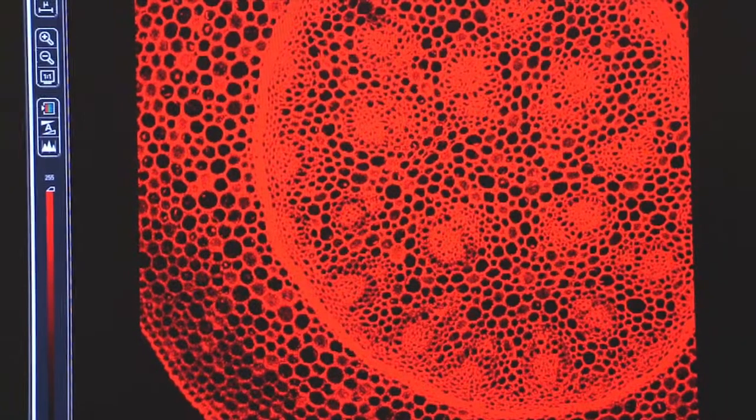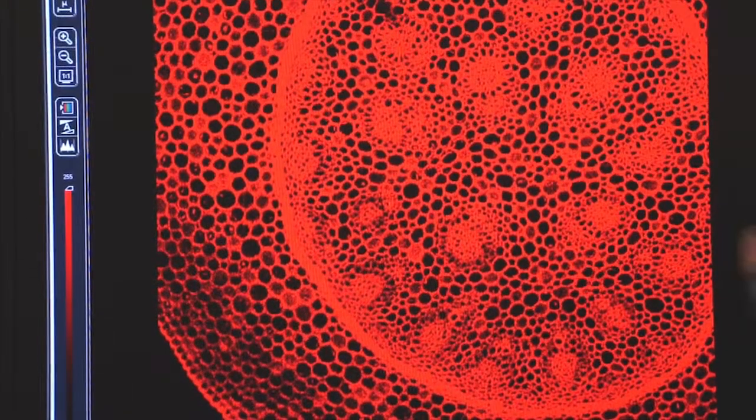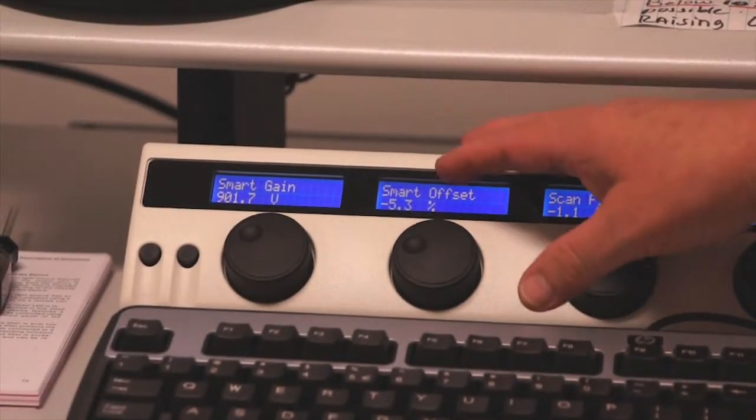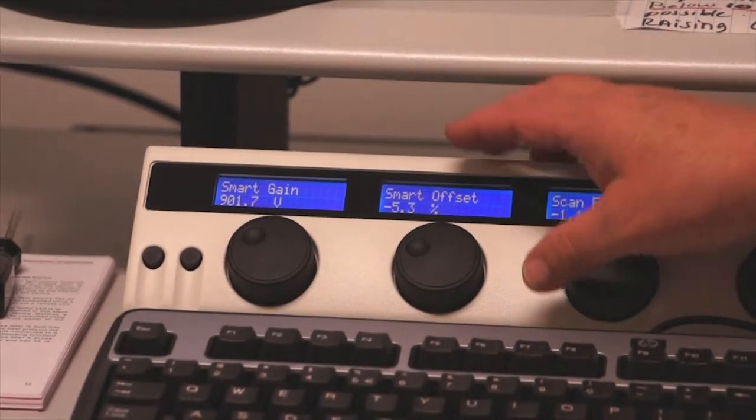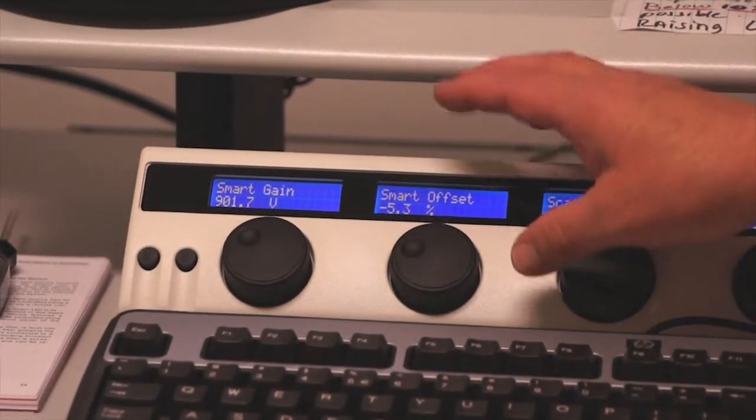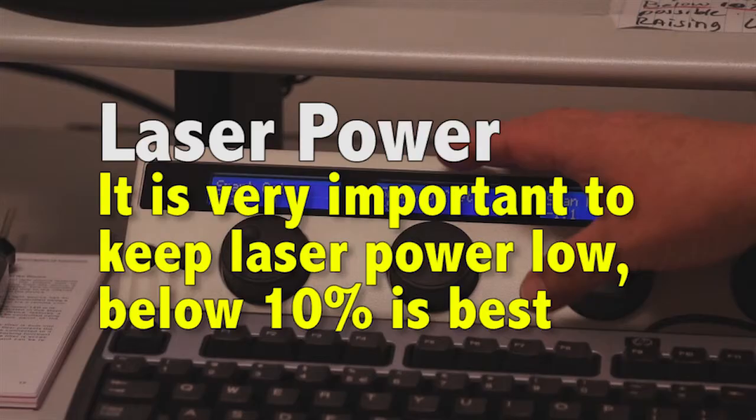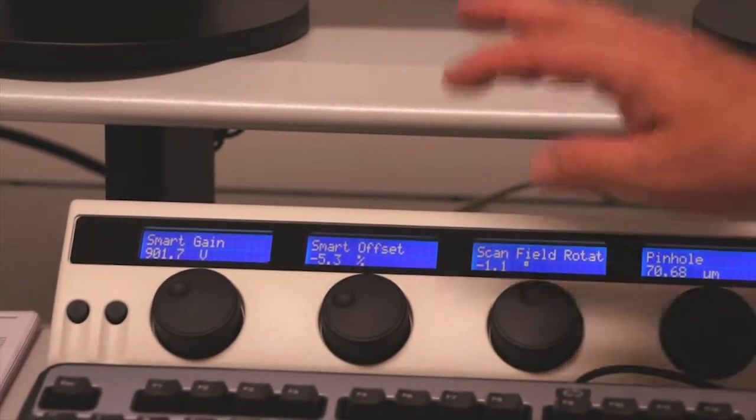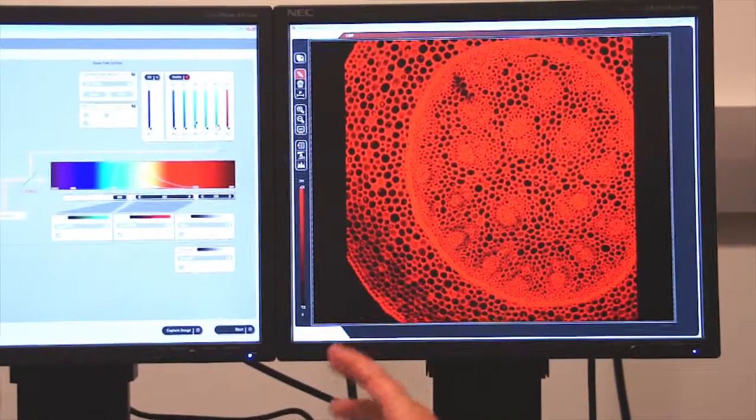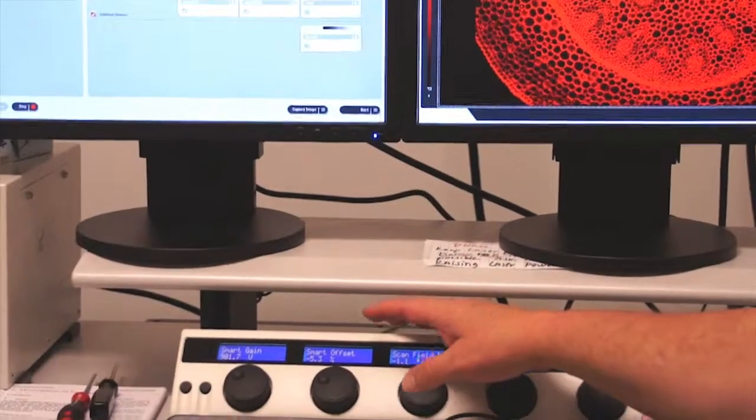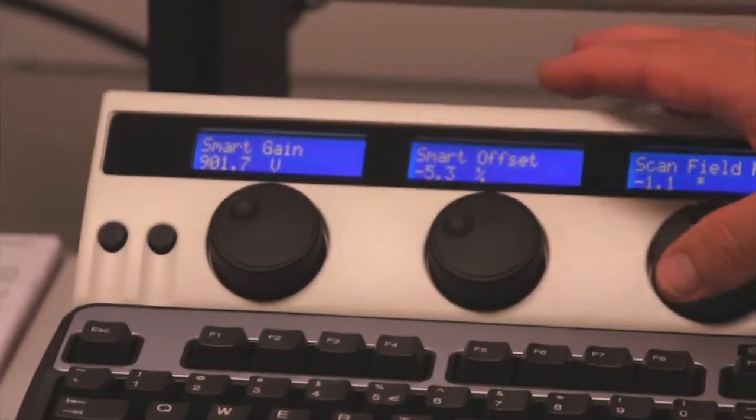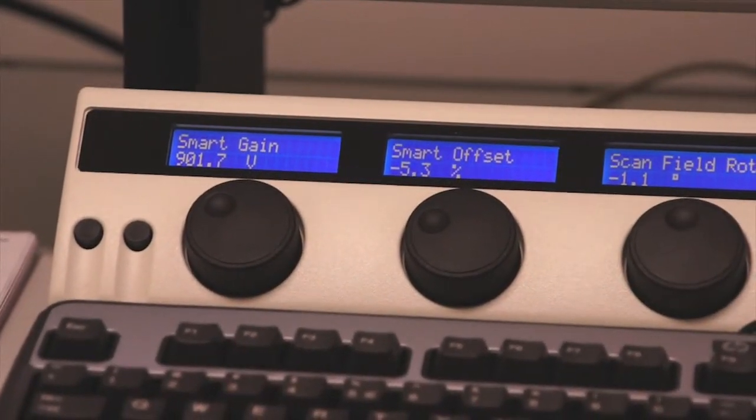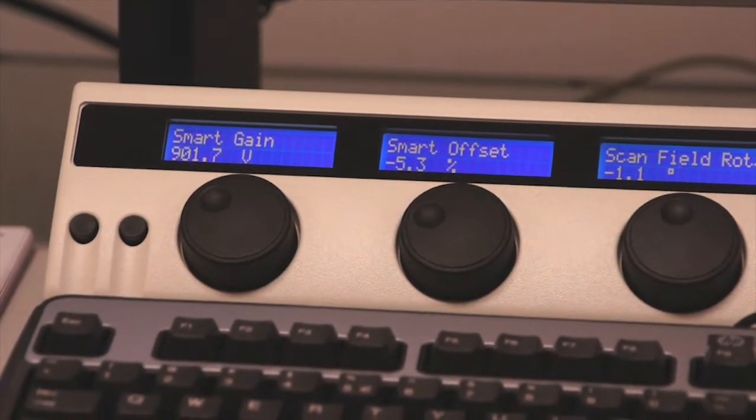What we're essentially doing is we're controlling the sensitivity of the photomultiplier tube with these two controls. The photomultiplier tube is recording and counting photons that are coming off the image. Again, I want to keep my laser power low and increase the gain and offset of my photomultiplier tube so that I reduce the photobleaching that takes place in my image and I reduce the amount of wear and tear on the laser. So a good rule of thumb is 900 on the smart gain and a negative number of 3 to 4 or 5 on the smart offset.